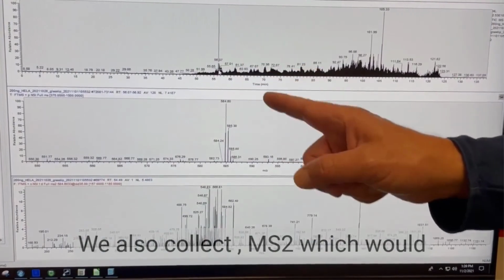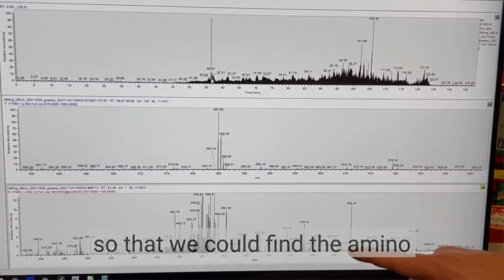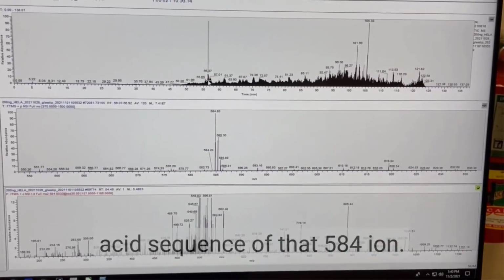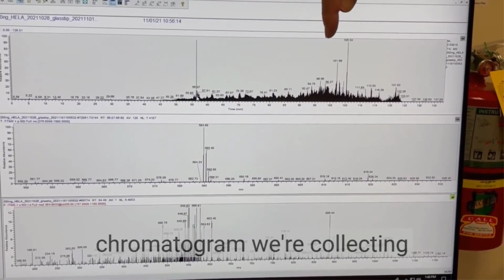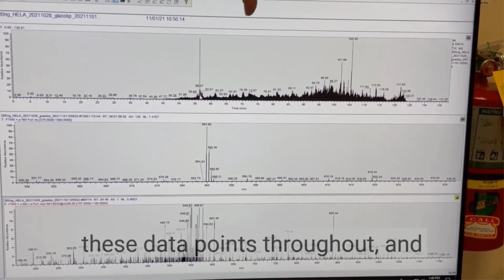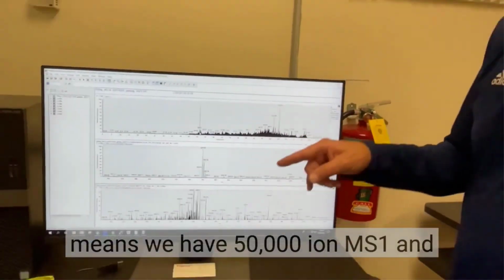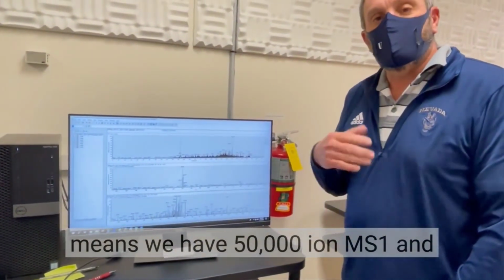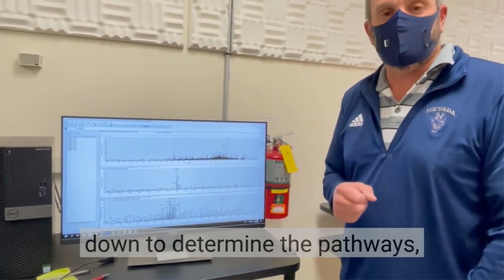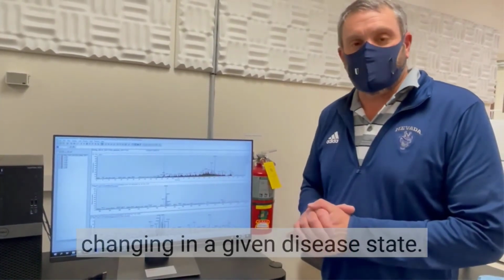We also collect MS2, which would be the fragmentation of that, so that we can find the amino acid sequence of that 584 ion. And all the way across this chromatogram, we're collecting these data points throughout, and we will collect somewhere on the order of 50,000 data points, which means we have 50,000 MS1 and MS2 spectra for us to process further down to determine the pathways and how these proteins are changing in a given disease state.